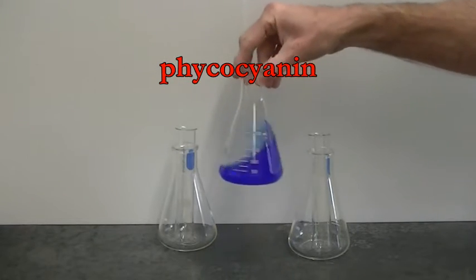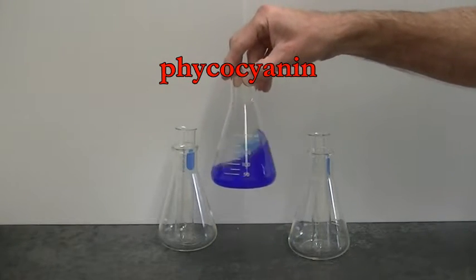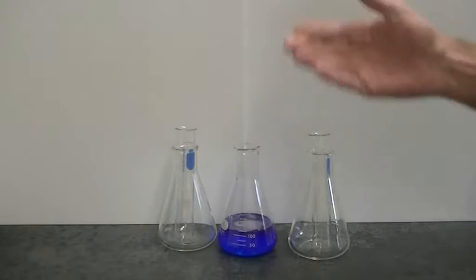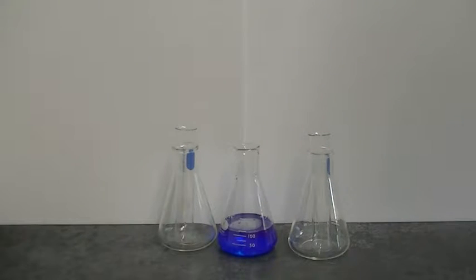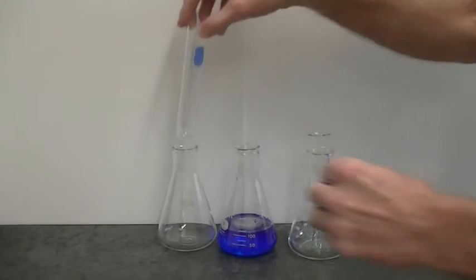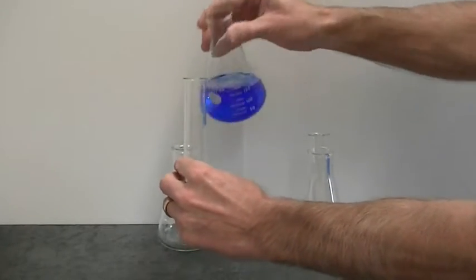Now phycocyanin has a blue color, and that's why this solution has this beautiful blue color. What's interesting is that when the protein is denatured, the blue color is lost, and this provides us with a really easy way to do protein denaturation experiments.